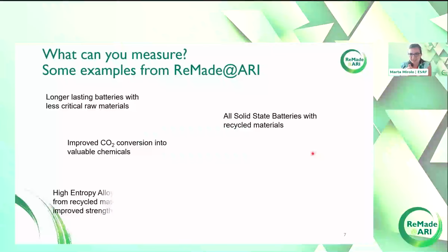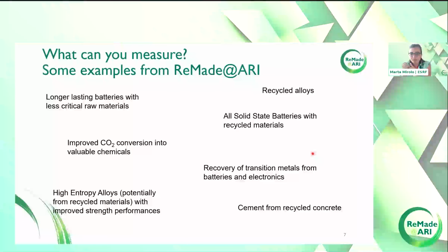And this has been done in the past couple of years. We measured plenty of samples. We did plenty of measurements, operando investigations on really different topics, from how to make batteries containing better materials, how to recycle the batteries, how to recover the transition metals, how to improve the conversion of CO2 into valuable chemicals, to cement from recycled concrete. So can we recycle the concrete so that we have cement with less CO2 emission?